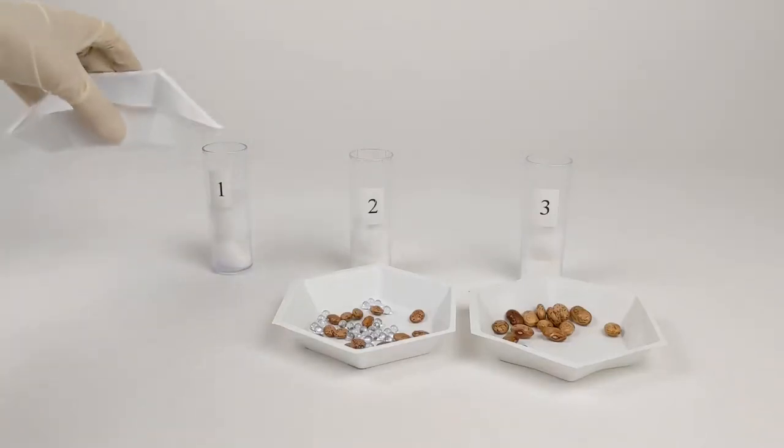So the next step is to finish assembling the respirometers. First by adding the contents to each vial. Vial 1 has glass beads.